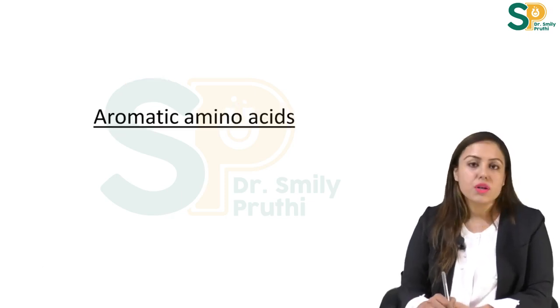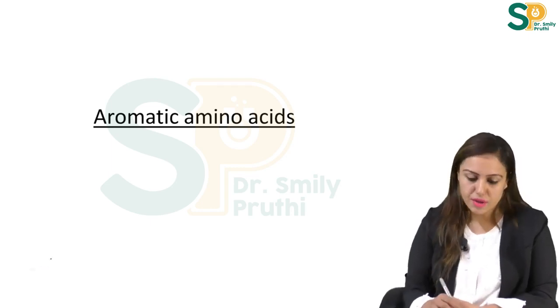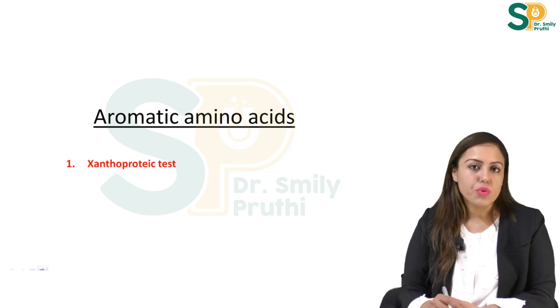Now next, coming to aromatic amino acid color reactions, there are many under this heading. One is Xanthoproteic test.